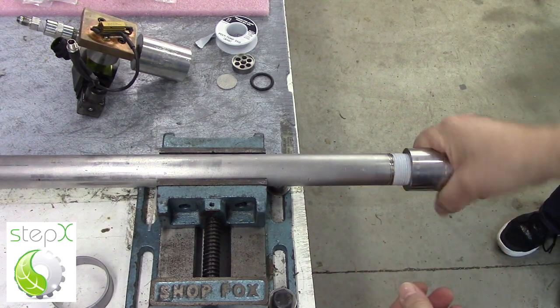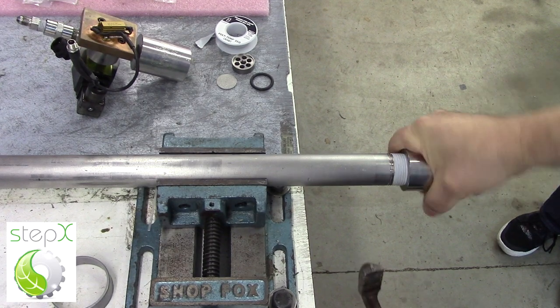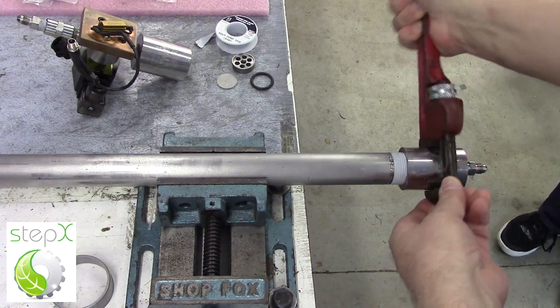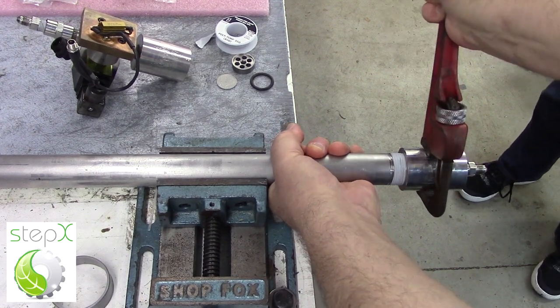We put the end cap on, put it on tight, and use a pipe wrench to make sure that it's very tight. You'll notice that you need a vise in your shop to make this even simpler.